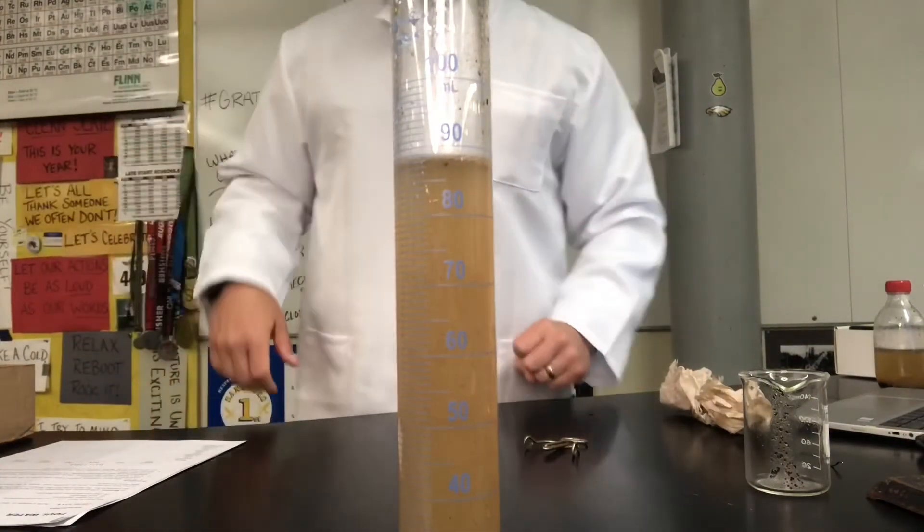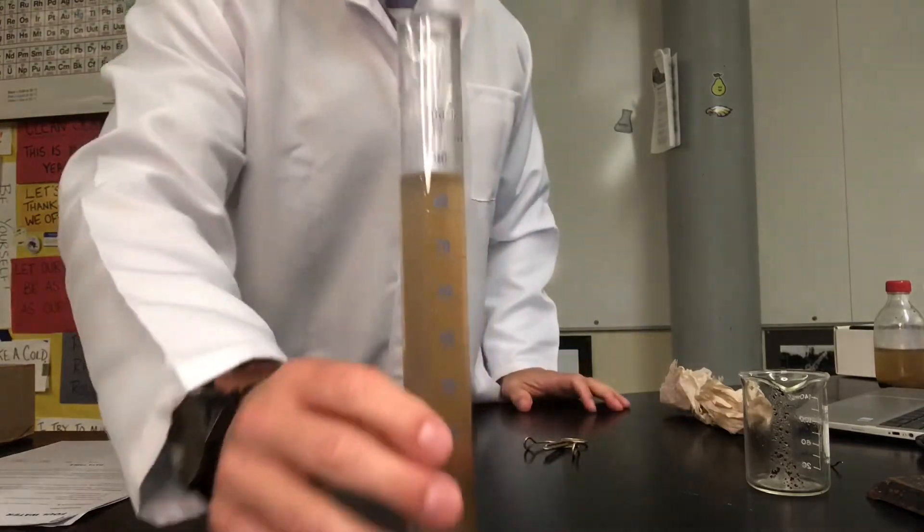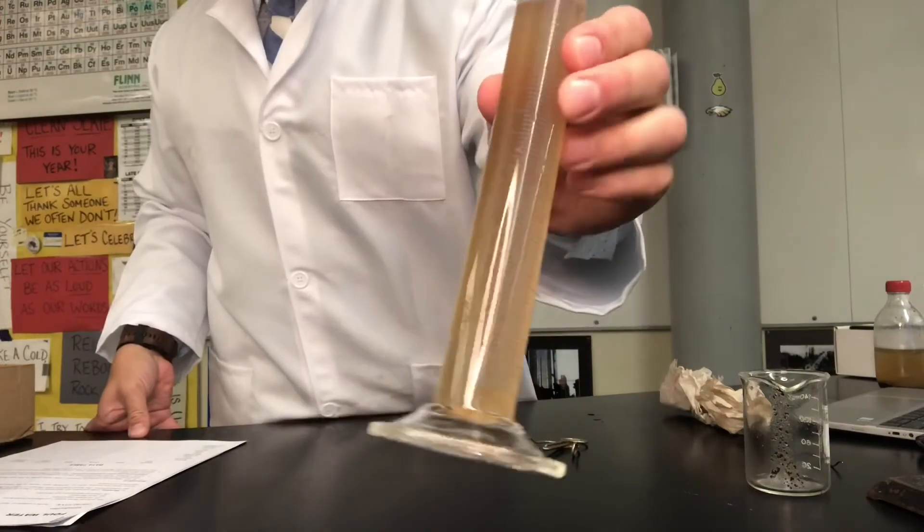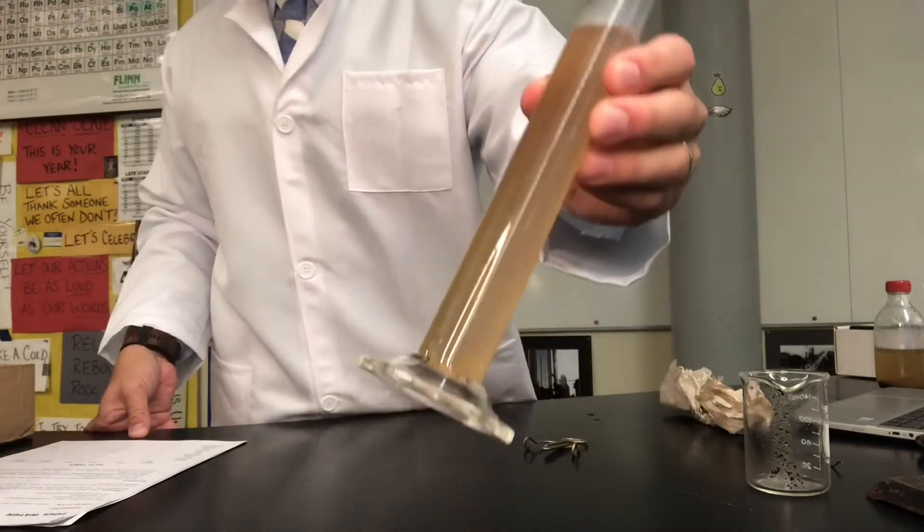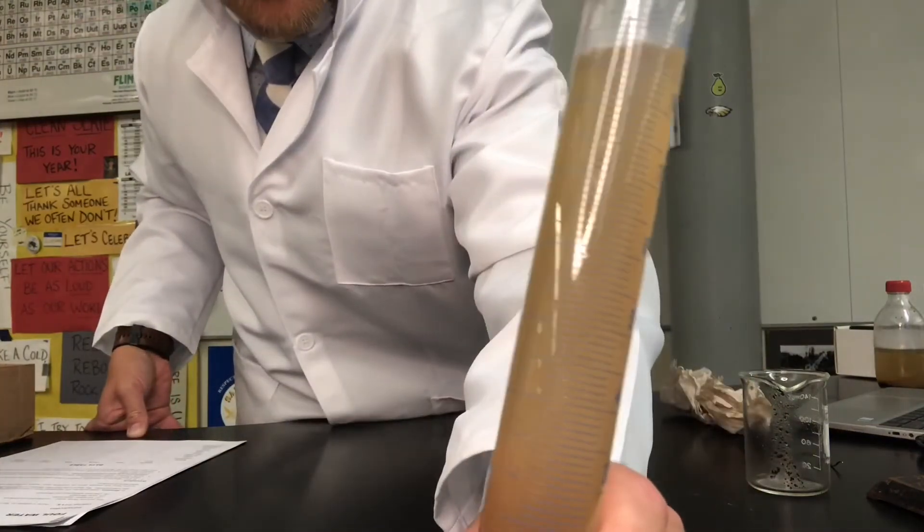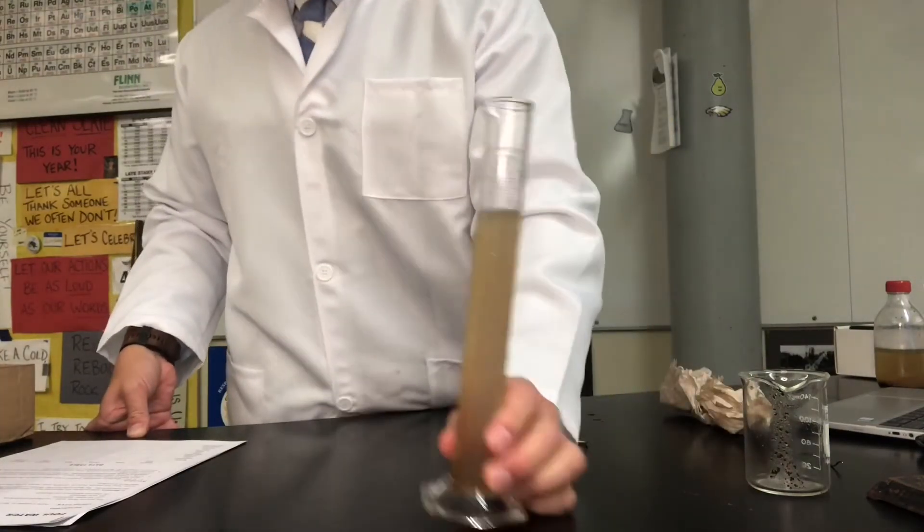So go ahead and write that down under after oil water separation there's 89 milliliters left. Now the color looks still about the same doesn't it? It's still that yellowish brownish beige color. As far as clarity it still looks pretty cloudy to me so nothing has improved with that.